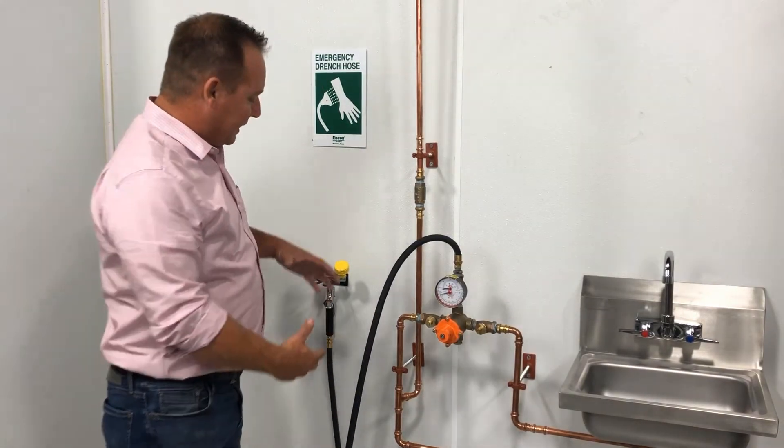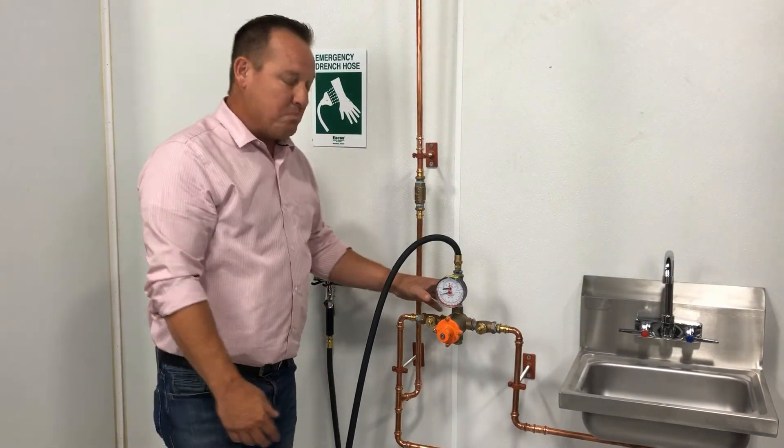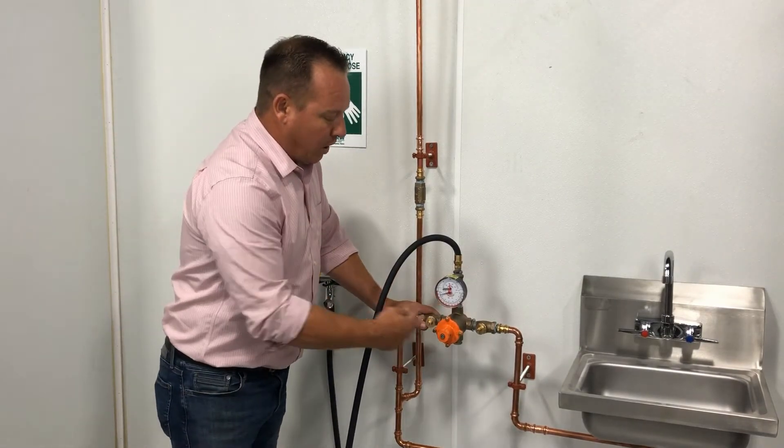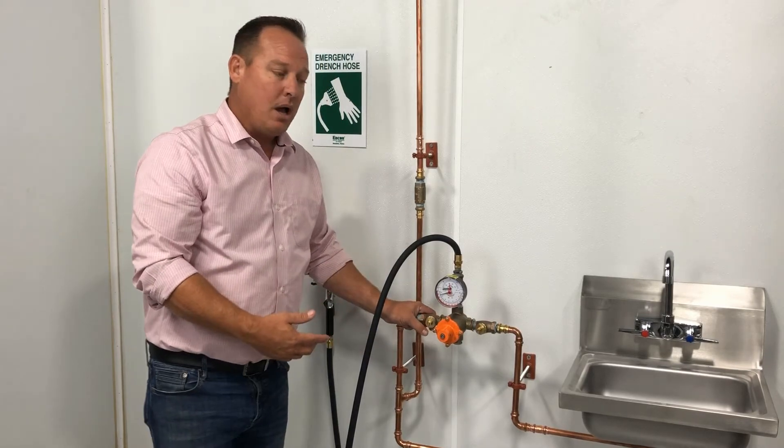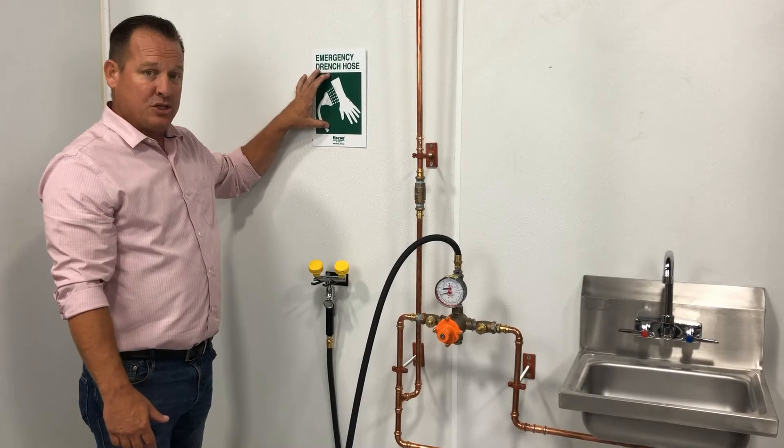Now that you've got your system completely set up — you've got your eyewash and drenching hose, your 1071 mixing valve, and your water blended to the correct temperatures — the last thing you want to do is make sure that you label this station with a highly visible sign.